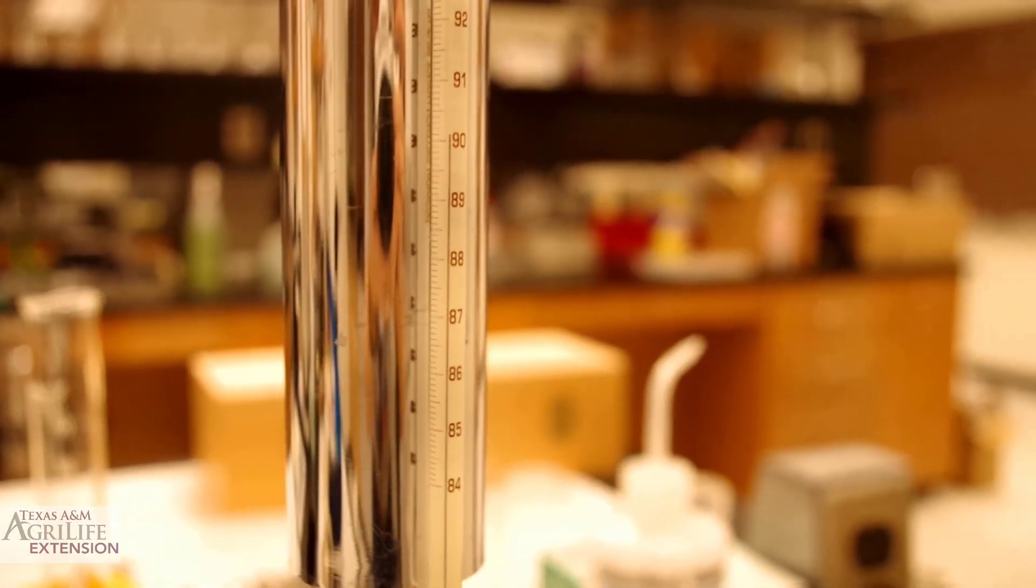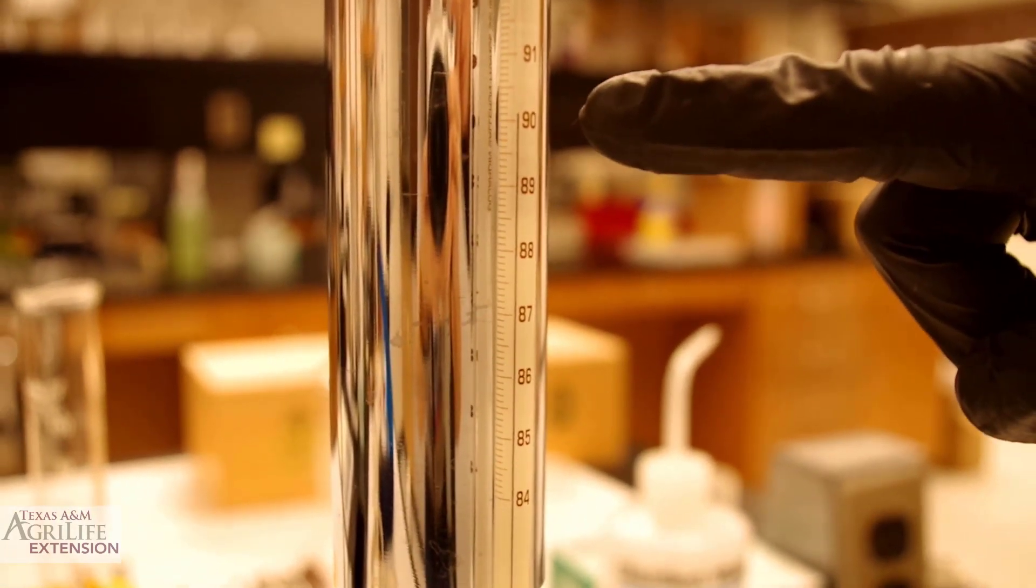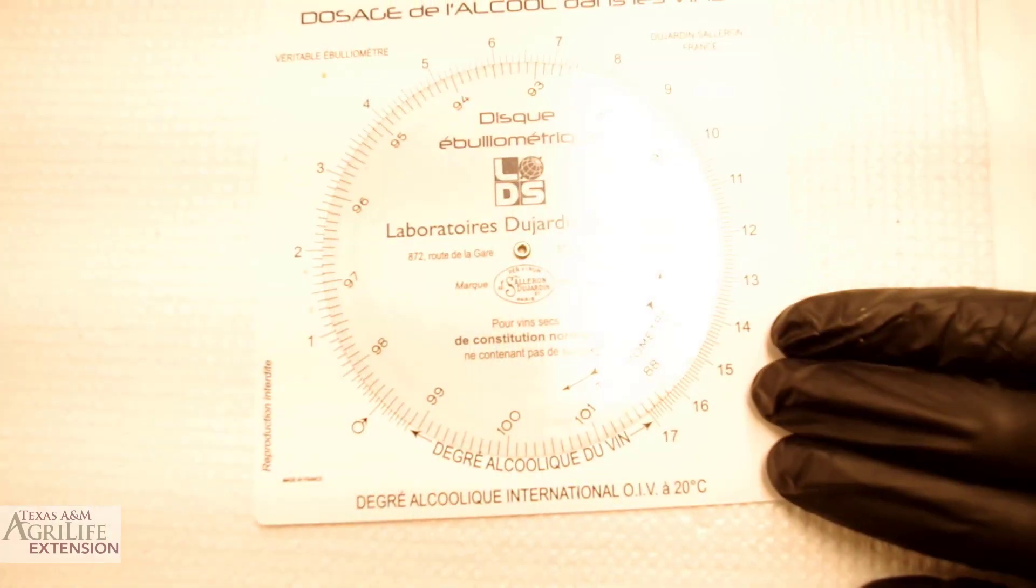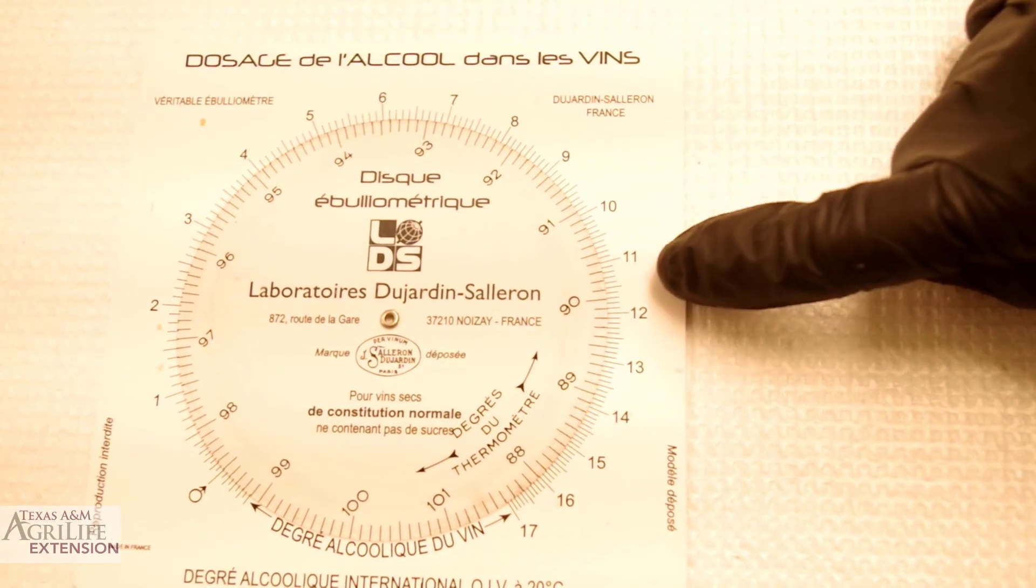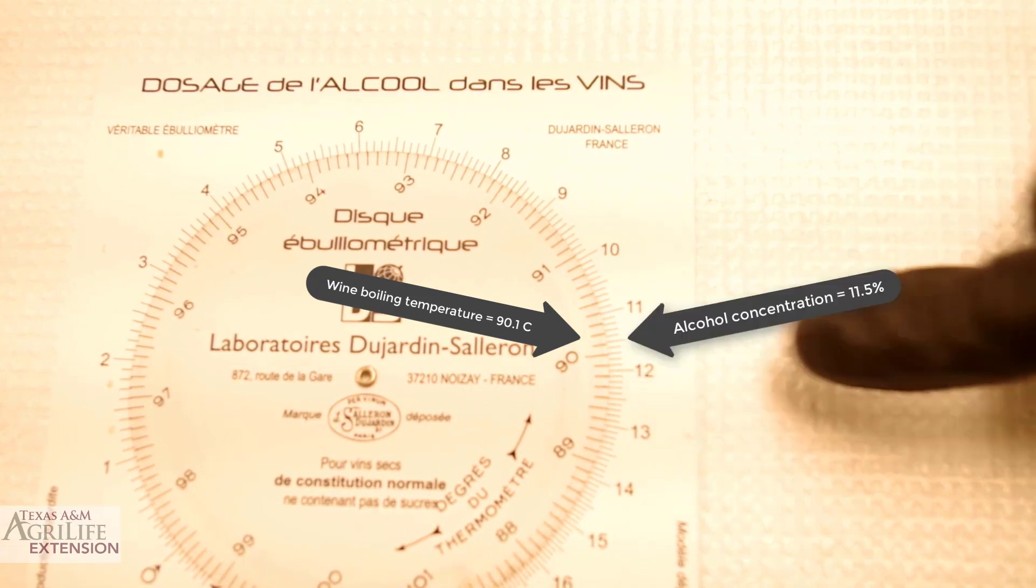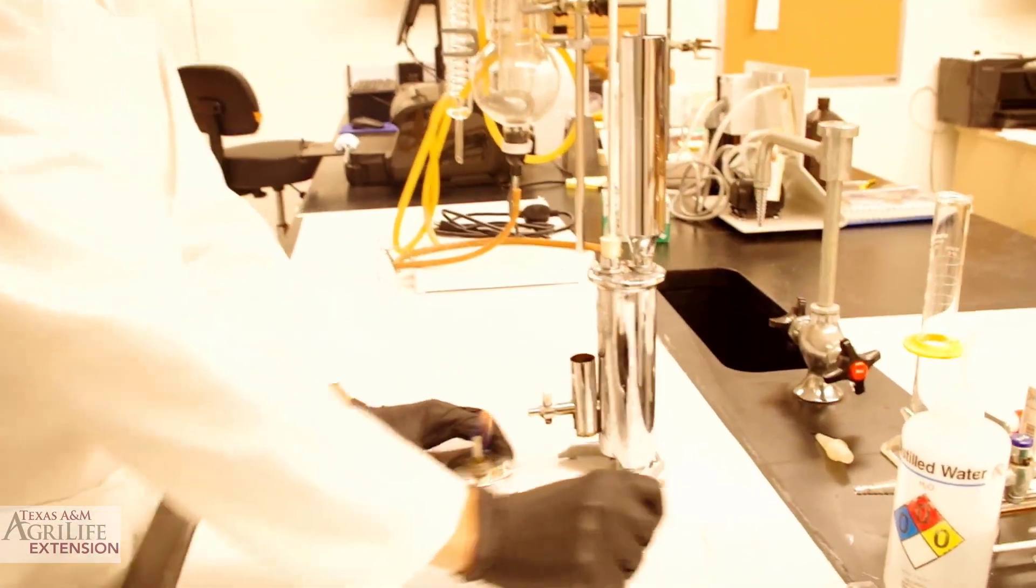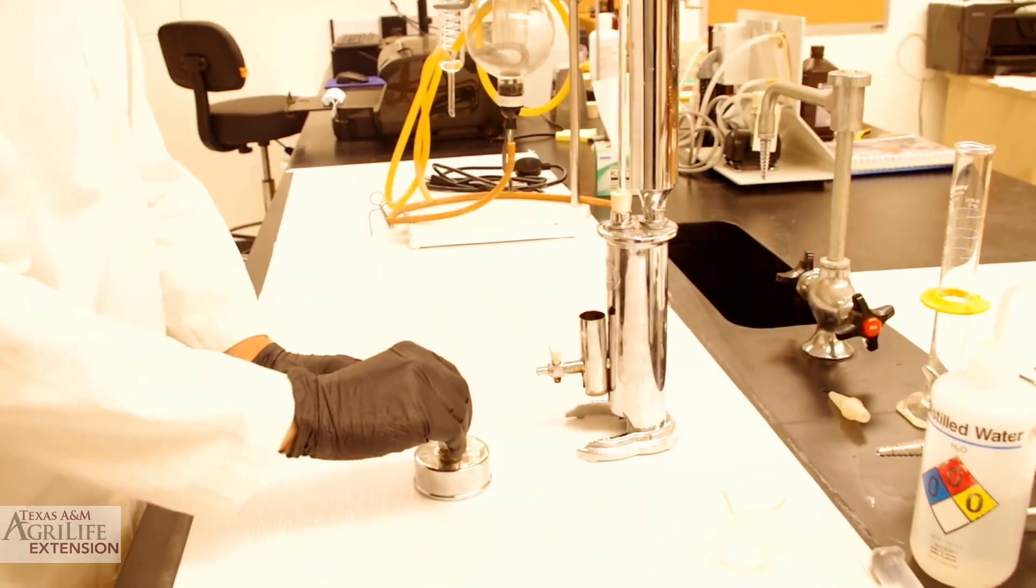You are ready to do your reading once the sample has been boiling and the temperature has stabilized for more than 30 seconds. Our wine boiling temperature today is 90.1 degrees centigrade. Going back to our dial, we find our wine boiling temperature on the inner circle and match it with our alcohol concentration on the outer circle. In this instance, the alcohol concentration is 11.5% alcohol by volume. We can now get our ebuliometer ready for the next sample.